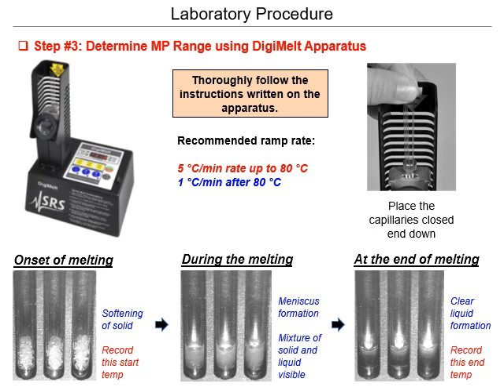So once you have that all set up, you would hit start. It's the green and red button there, and it would start climbing. And basically, once it gets to around 80, you need to constantly be looking in that little eyeglass to see when things start melting. So on the bottom of this slide, you can see what these things actually look like.